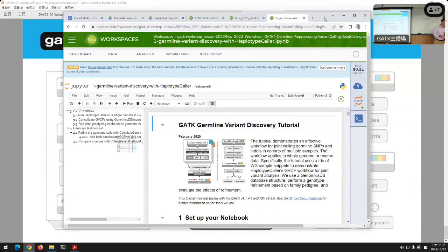You can see the original and the new haplotypes, and the reads aligned to the other haplotypes if you want. It's not on by default because it's a lot. The input and output is the thing killing you here: you're reading in all the reads and writing out all the reads again. So most people don't want to spend the compute for that, but you can see it for sure. Great question. Did I answer your question?